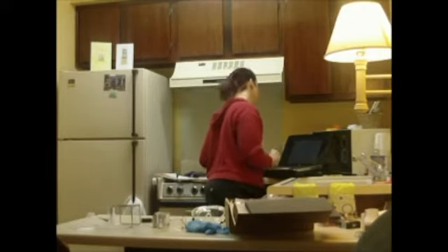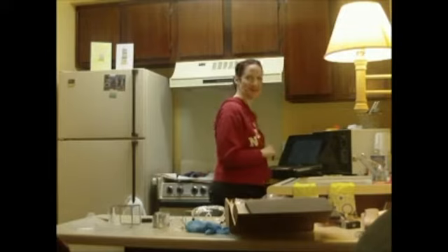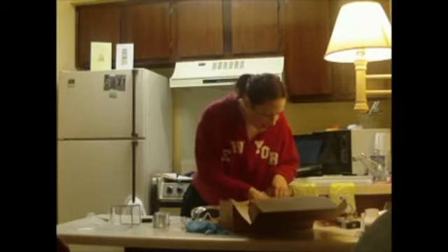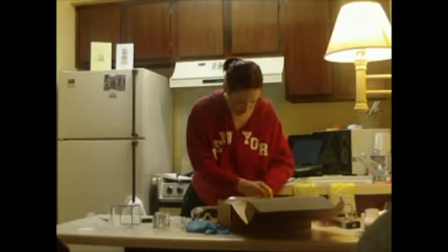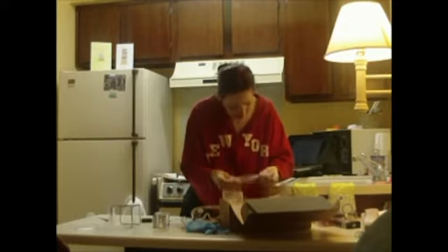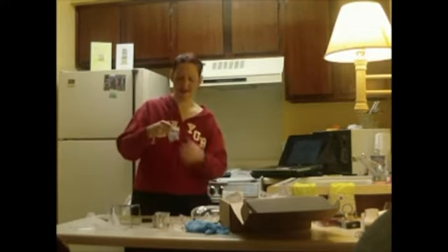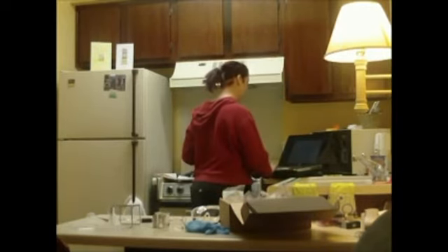Okay, so in our auxiliary supplies bag, we have litmus paper blue in a bag, 2 inch by 3 inch, and also litmus paper red in bag 2 inch by 3 inch. That just goes to show how often I see the word litmus in daily life. Okay, I'm looking for my little bag in here. Here we go. This is our auxiliary bag, and we've got our litmus blue and our litmus red. So that's what we need from the auxiliary supplies bag.